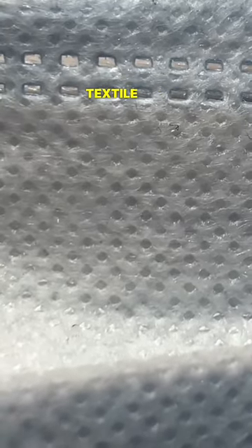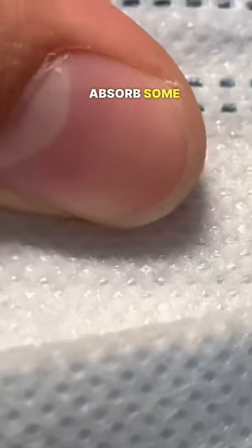So these are actually just textile fibers. If I add a bit of moisture with my finger here, they're going to absorb some of the water, and as they dry out, it gives the illusion of it being alive.